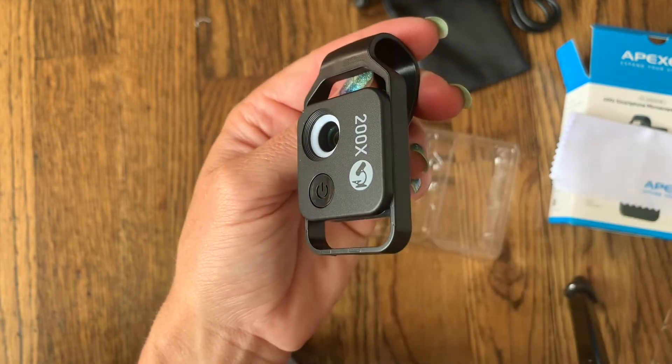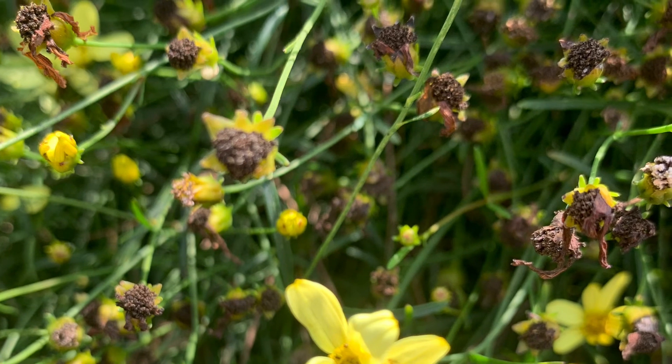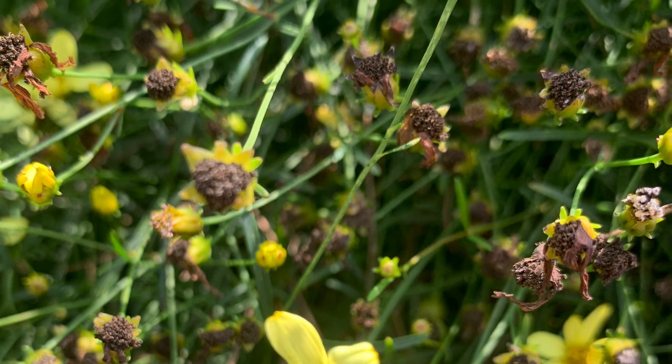I'm going to connect it to my phone and go ahead and test it out. Here's an example of how the microscope works — if you can guess what we're looking at, you're pretty good at close-up pictures, because this is so magnified that it looks totally different than what it actually is. Here is just a photograph I took using the microscope, so you can see how clear that picture is. And here is the answer — it was one of these tiny yellow flowers, really zoomed in.